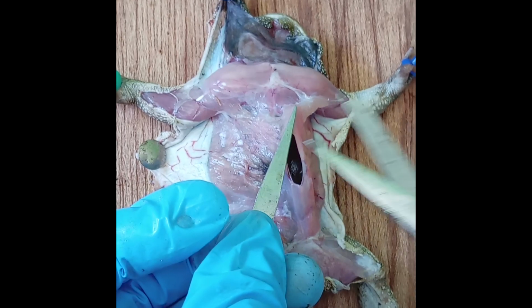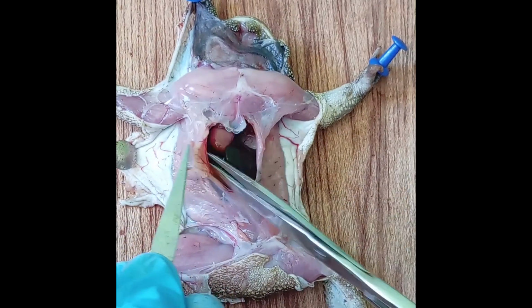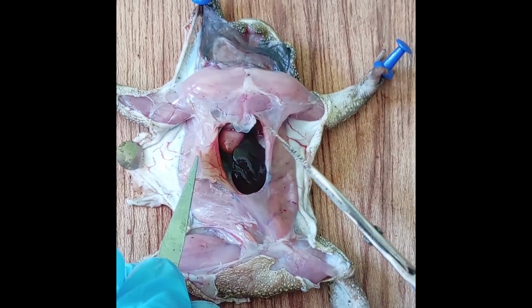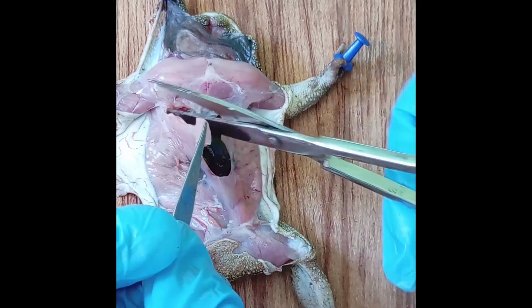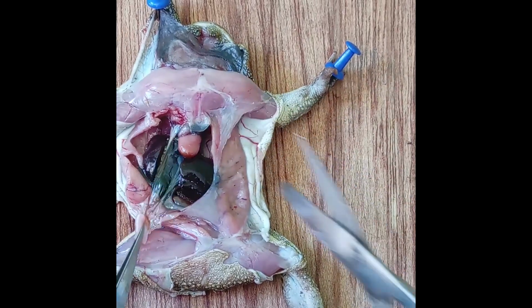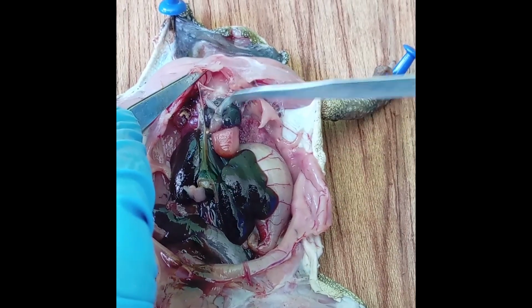If you remove the body wall from the toad, you see this looks like the xiphoid cartilage in mammals. And look at the heart. That's the heart lying there, in a clear area. If you remove this muscle, you will see that the lung is also there. If you remove that muscle too, there's another lung there. Now, that's the area.